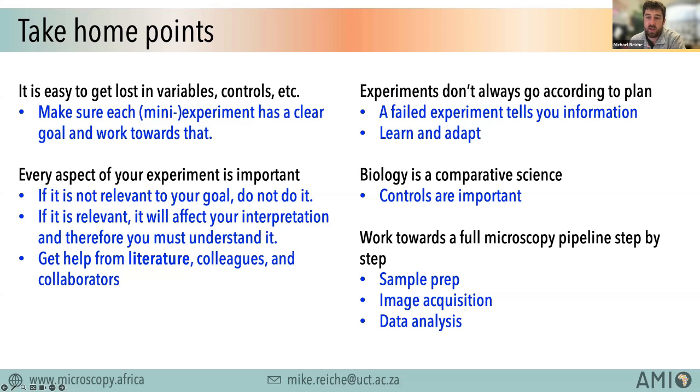Yes. So I agree 100% with both of those points Emmanuel has mentioned. Never ever jump into a full-scale experiment. You have to build yourself up slowly, because the worst thing that can happen is that you now have hundreds of gigabytes of images and they're useless because they didn't capture the correct information you needed. So I'm of the opinion that you should go slower and steady rather than just trying to get to the end as quickly as possible, because more times than not, that ends up putting yourself at a disservice, in all honesty.